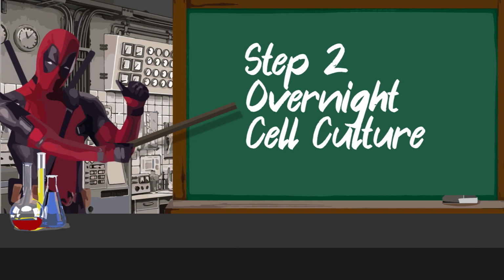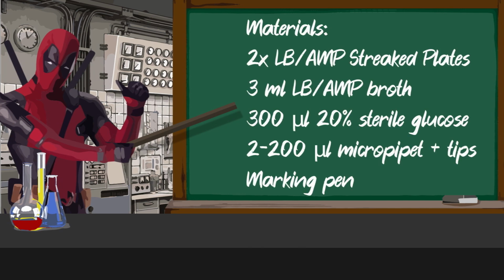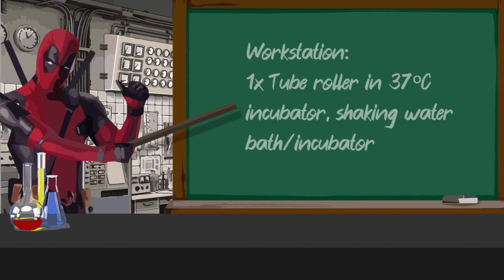The next step is the overnight cell culture. Within this, the objective is to amplify the transformed bacteria that were used in the previous step. In order to do so, the materials you need are the plates from the previous step, the broth, and the shaking incubator set at 37 degrees Celsius.